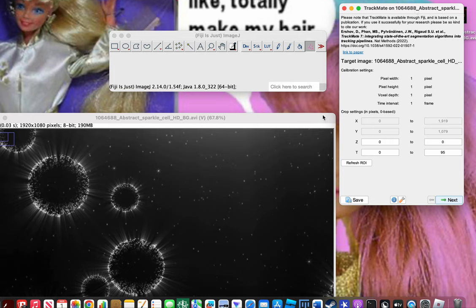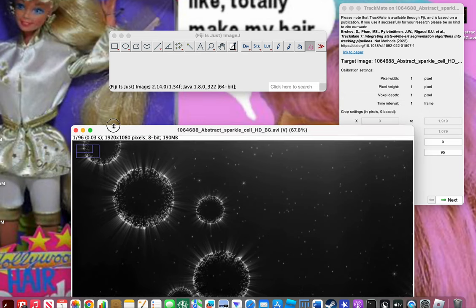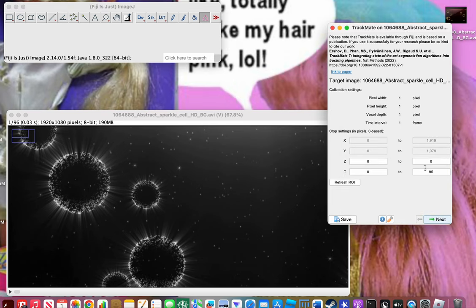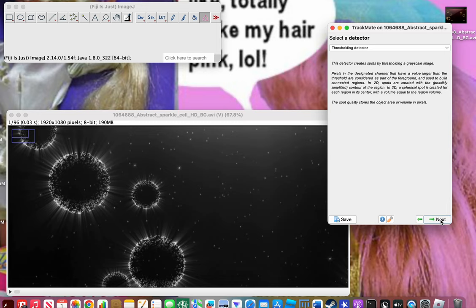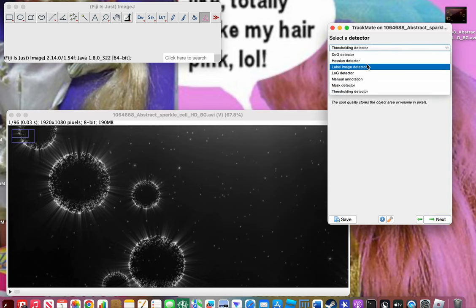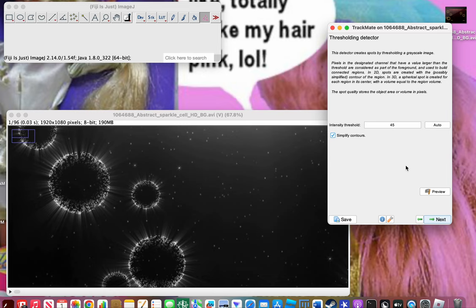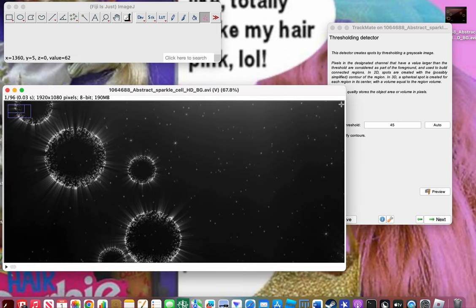This is just an overview. TrackMate counts in units of pixels and frames, though you might be using nanometers or something else, so make sure you know what you're using. Click Next. The next thing you have to do is make sure you're using the Threshold Detector. You have to use the Threshold Detector because we're using grayscale — it's going to detect light against the dark.